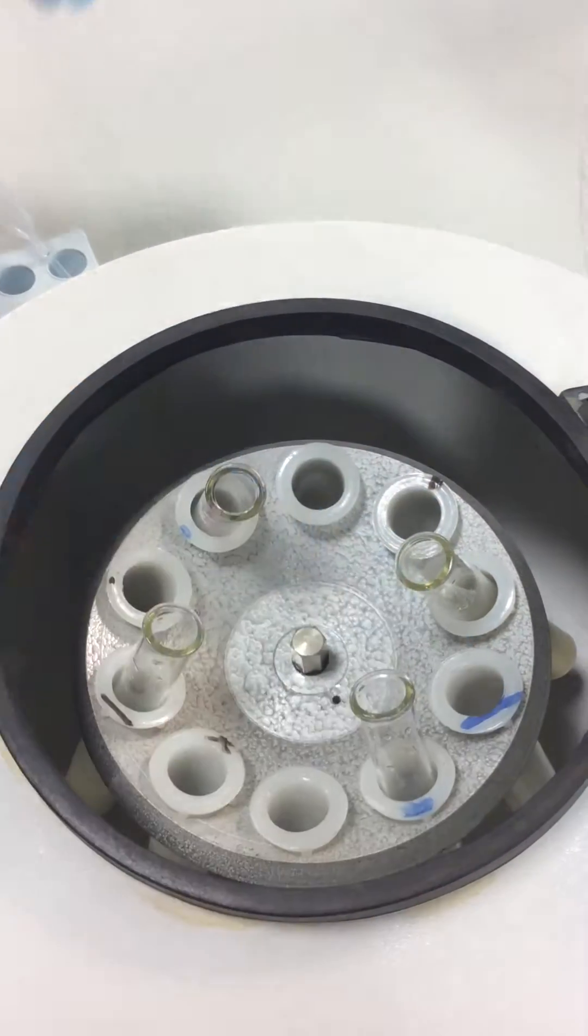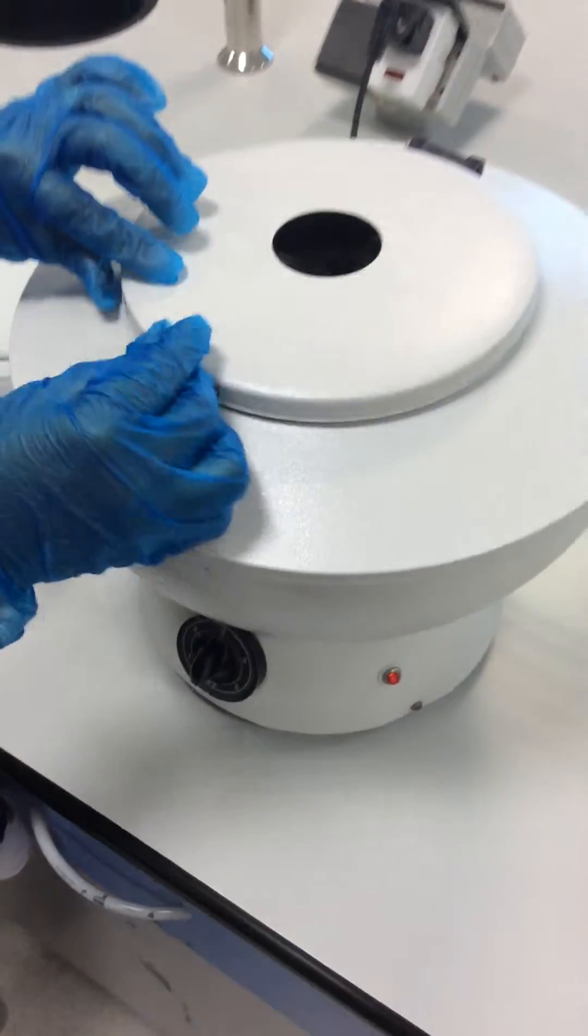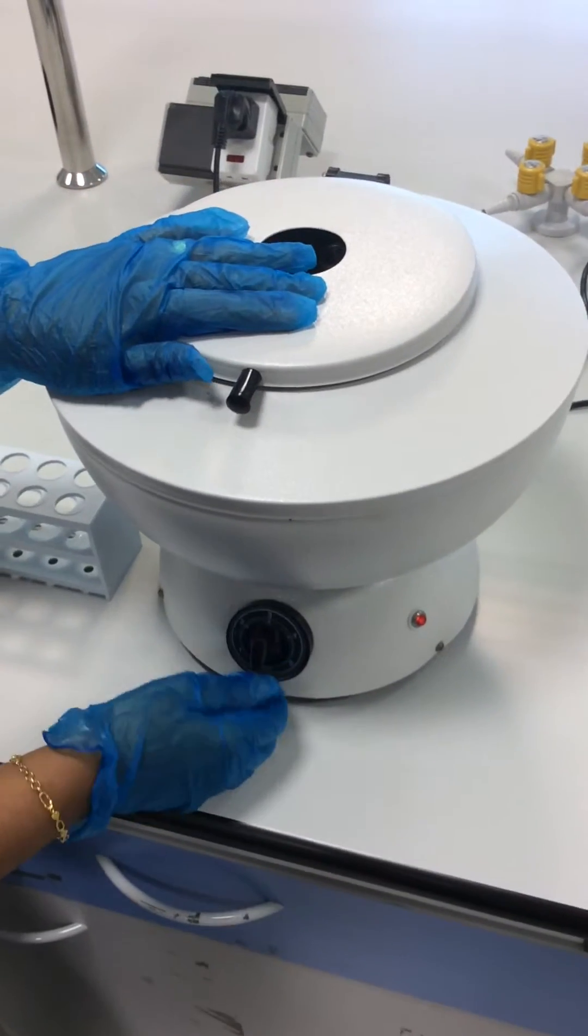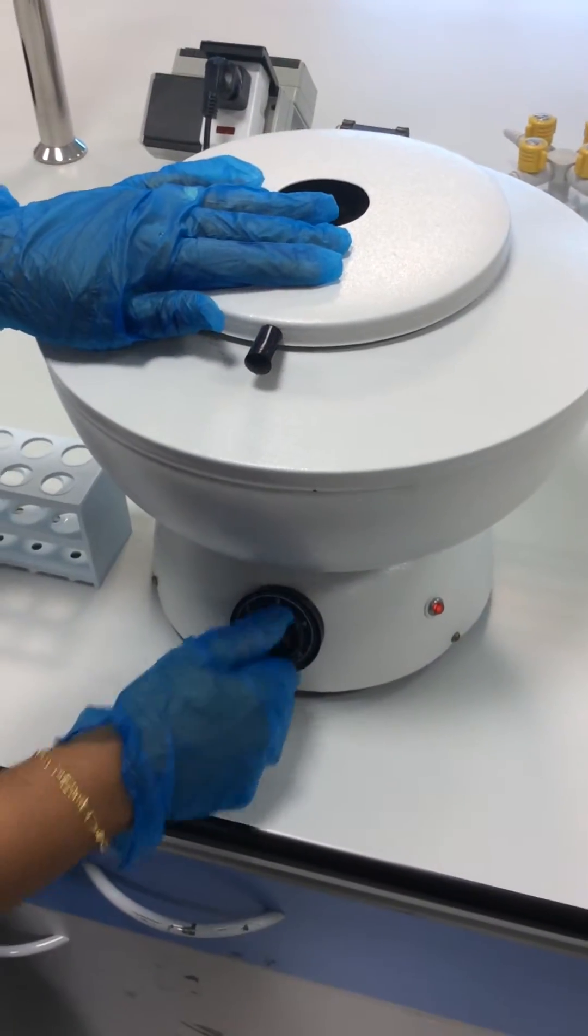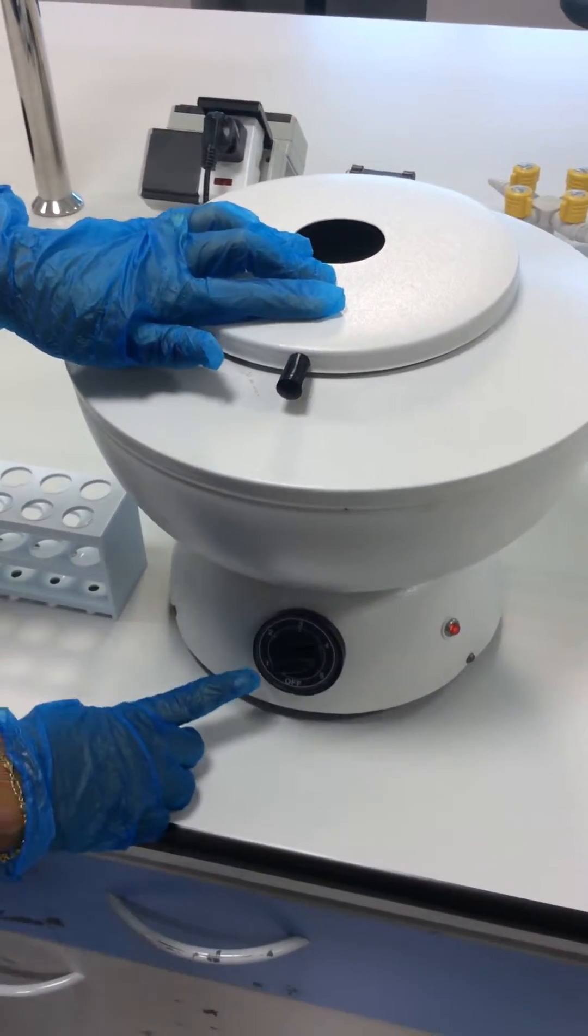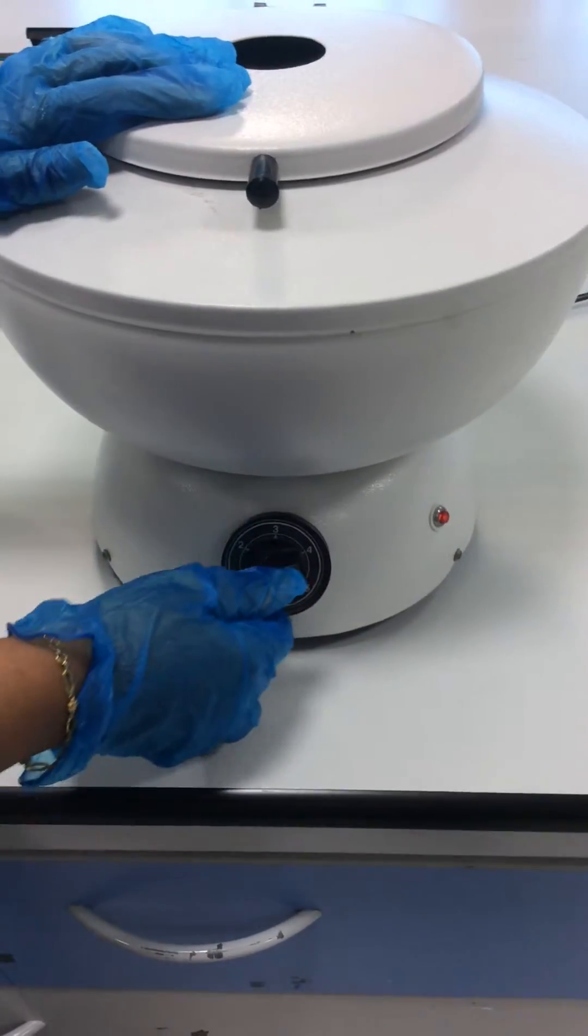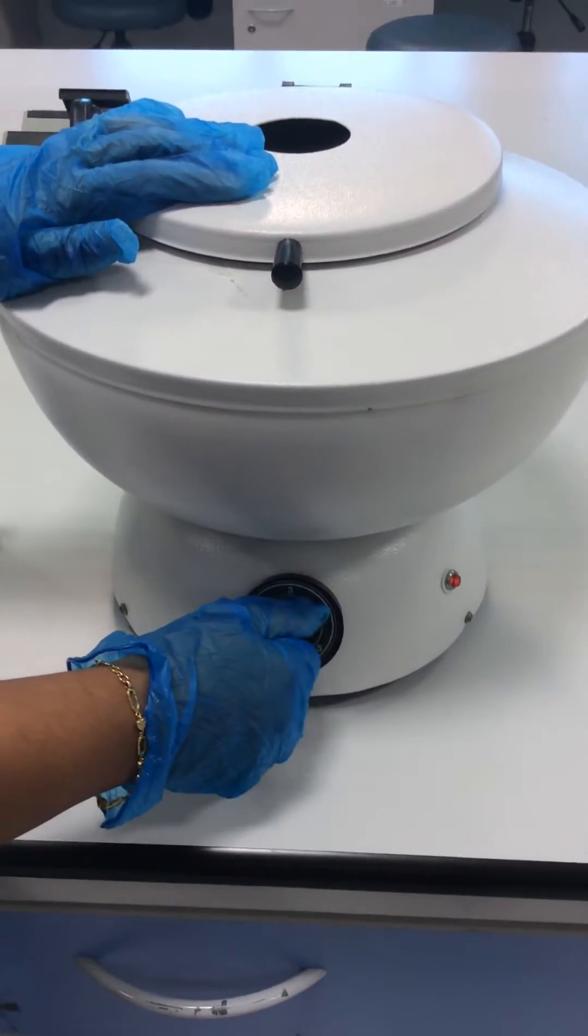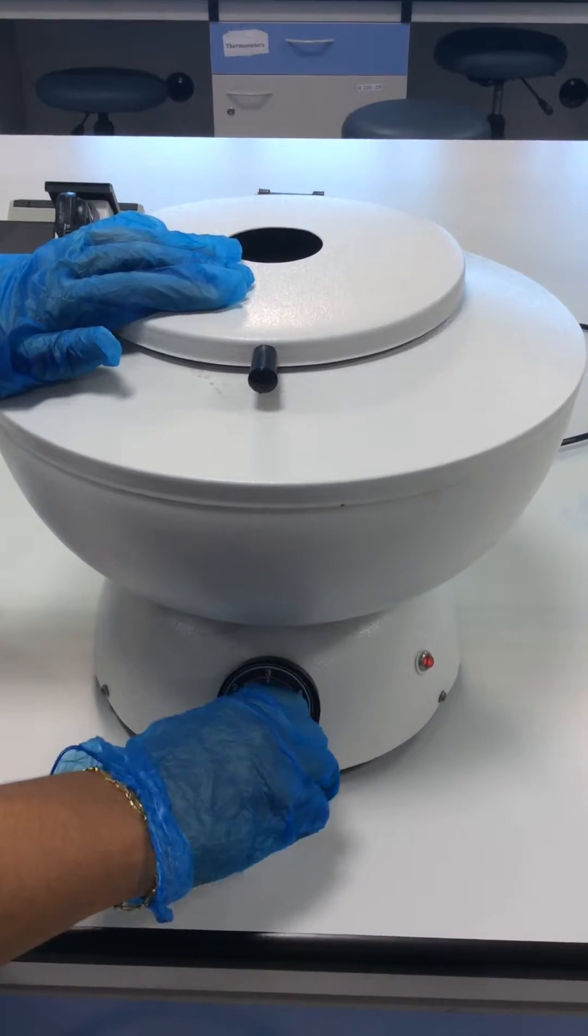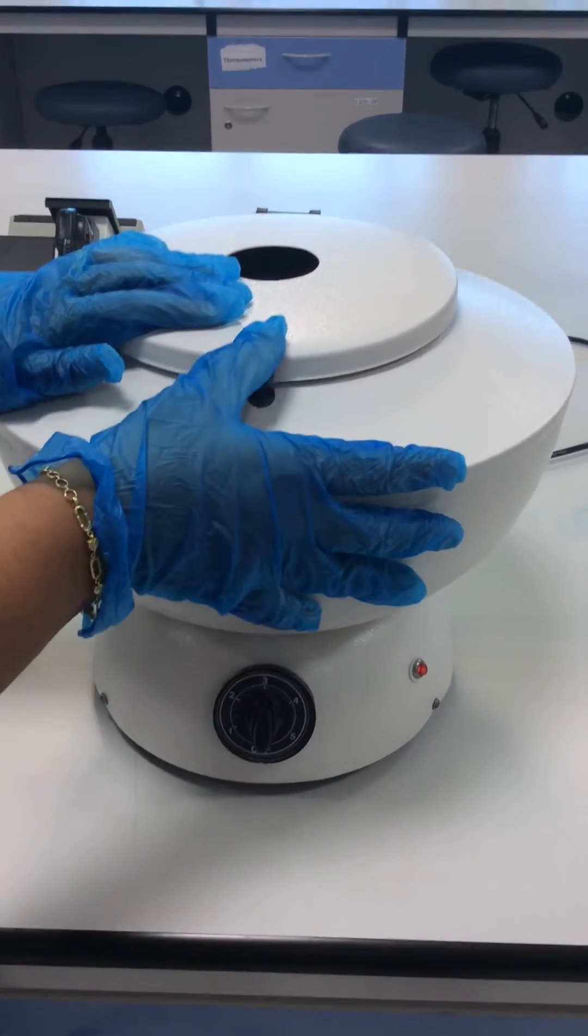I will close the lid of the centrifuge and then turn it on. I start at speed 1 and then slowly increase the speed up to 5.